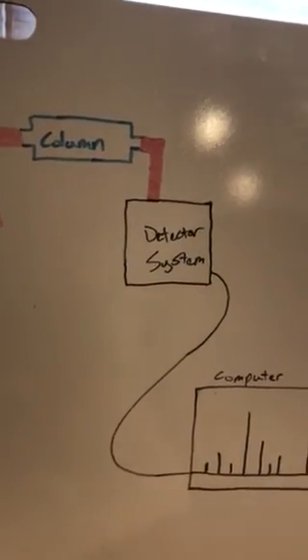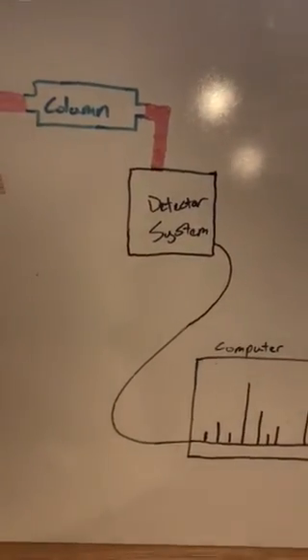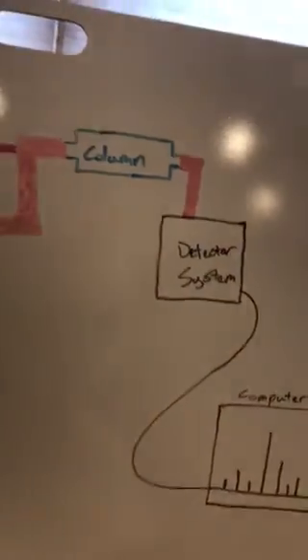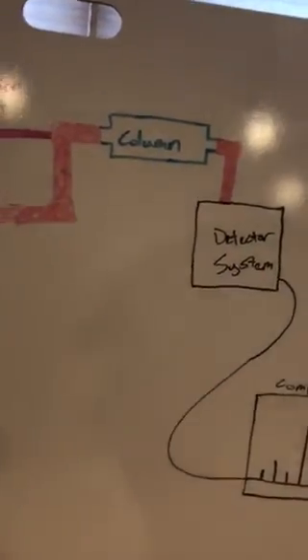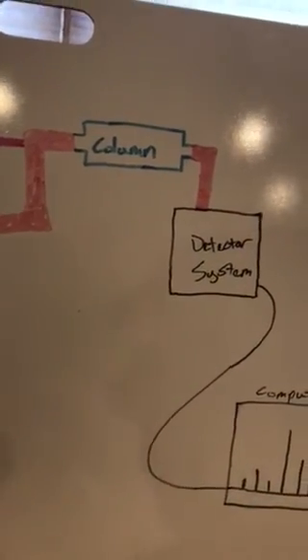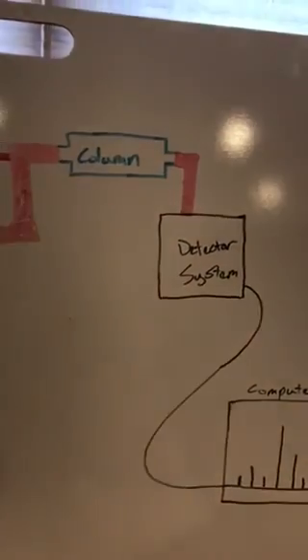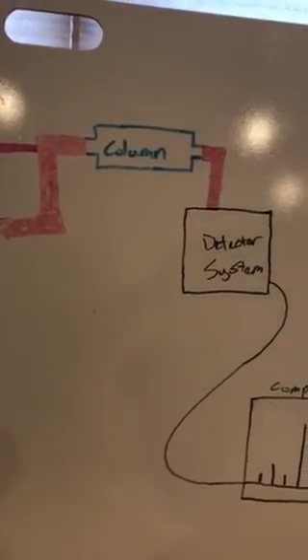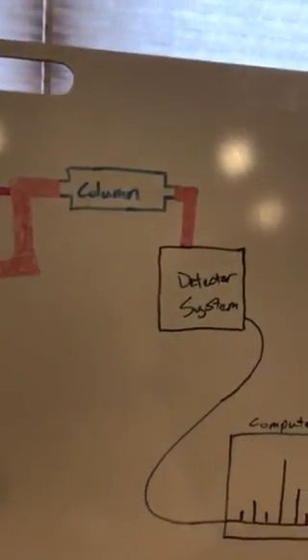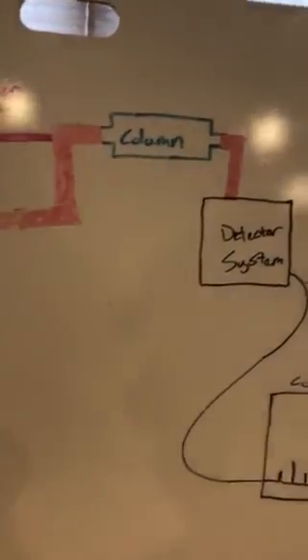Qualitatively, we're able to compare results from multiple different experiments so long as we keep the wavelength set at a very specific value. And then quantitatively, we have something called Beer's law, which allows us to compare concentration values as well. The issue with this is not everything absorbs in the same range. And so if something's absorbed outside of the UV-Vis region, it can't even be detected, and so that can cause issues in our experiment. Also, since we're working at such low concentrations, it could be so low that we don't even notice an absorption, unless you were to increase that concentration.